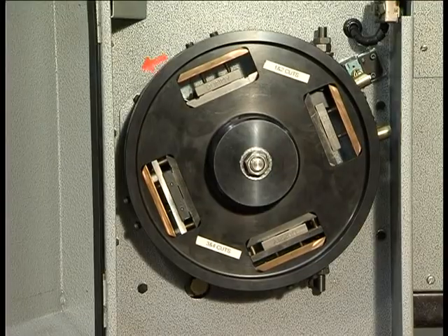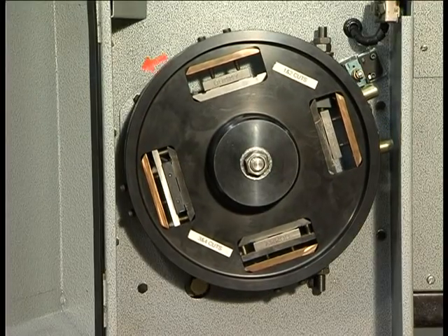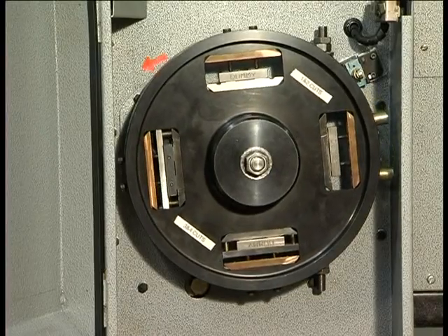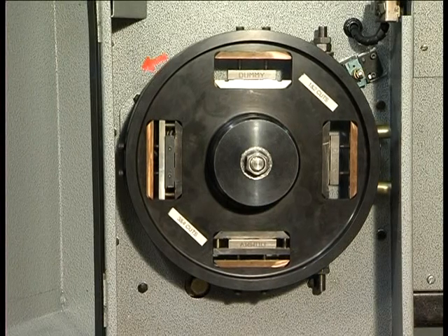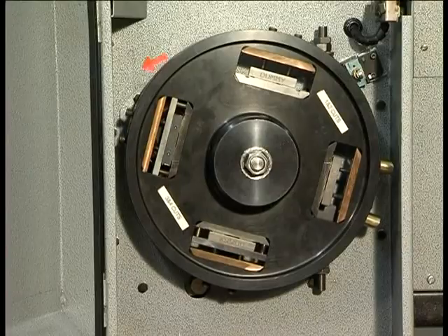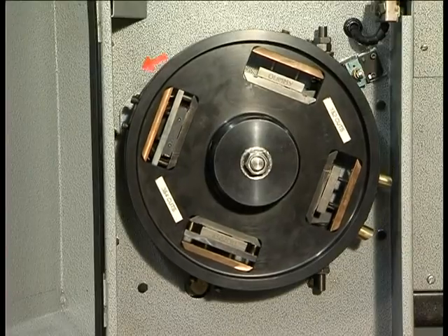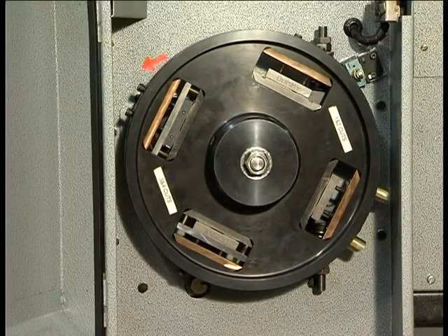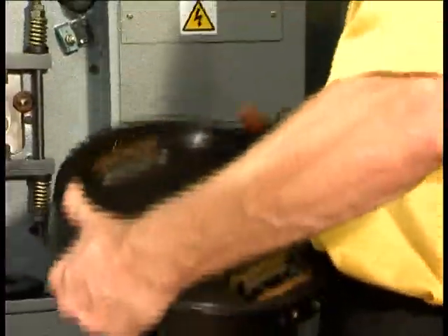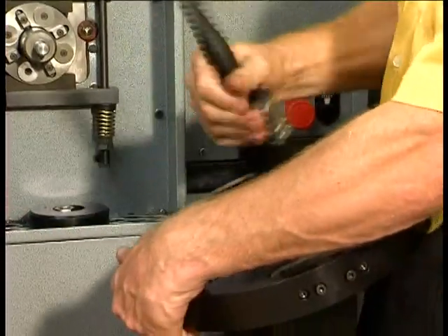The fixture is again secured on the fixture spindle, remembering to keep the locating face clear of debris. The cycle button is pressed to machine the third cut. When complete, the fixture is removed, cleaned, and rotated 180 degrees and re-clamped on the spindle to machine the fourth cut. The 10mm square sample is now complete.